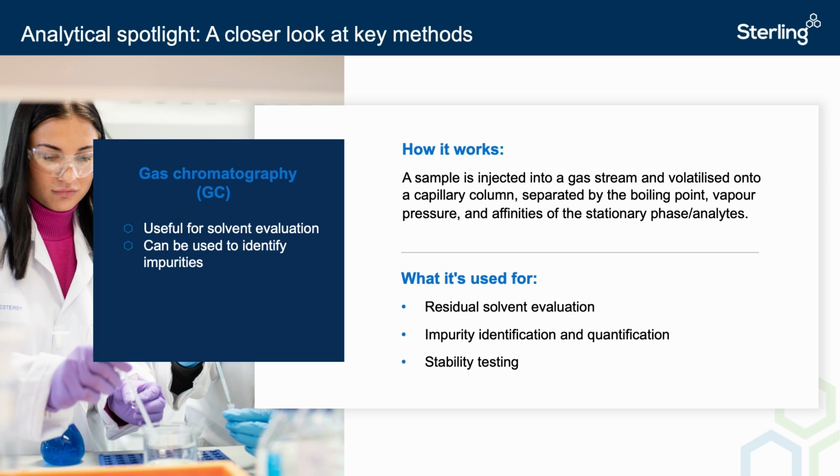GC is a very versatile method that can be customized for efficiency to quickly and accurately measure the solvents used throughout the synthesis of pharmaceutical batches, as well as the purity of samples that can't otherwise be analyzed by HPLC.